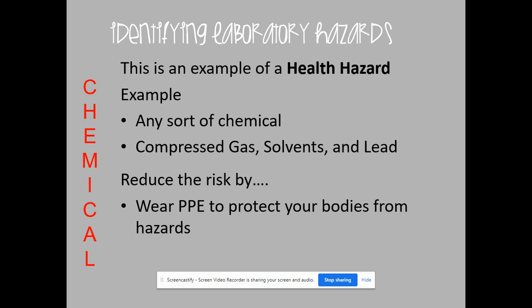We want to wear our appropriate PPE. In the classroom, that would be our goggles and our gloves, and sometimes our apron, depending on what we're doing. If we can, use a less toxic chemical, and store chemicals in the fume hood.